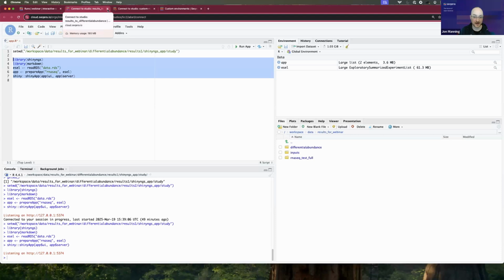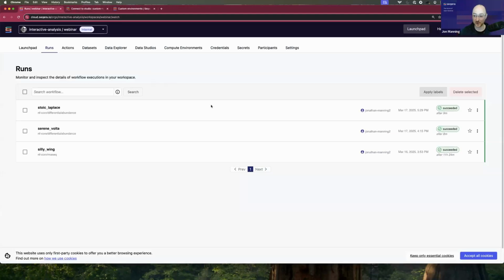I'm acting as a bioinformatician here, and my colleague Edmund is going to play the role of almost like a biological laboratory scientist collaborator. And he's going to log on, and we're going to look at the results of that exploratory analysis together, so that we can make some calls about what analysis we might want to do downstream of that. So I'm going to stop sharing now, and Edmund, if you want to share and connect.